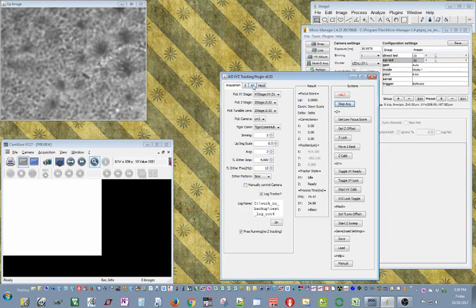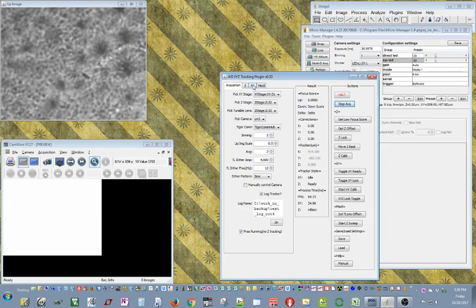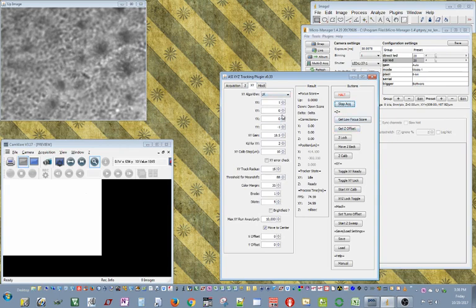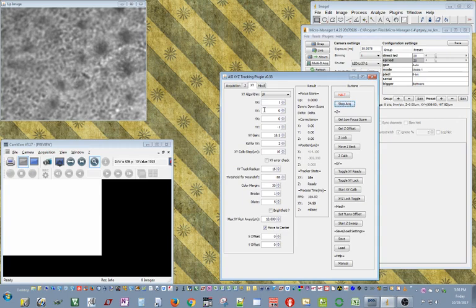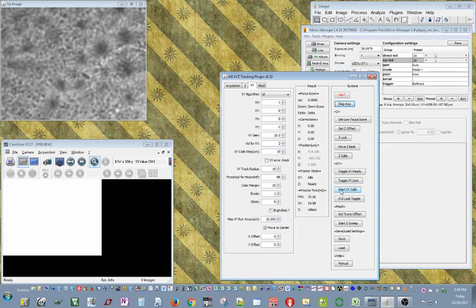So first I need to calibrate the XY of the camera, calibrate the camera with the stage. That is, the camera might be perpendicular to the stage driver log, there could be mirrors. So we have a small routine that we run XY calibrate that will move the stage once in X and then in Y and then it sees how the images have shifted and it fills up these boxes with appropriate settings.